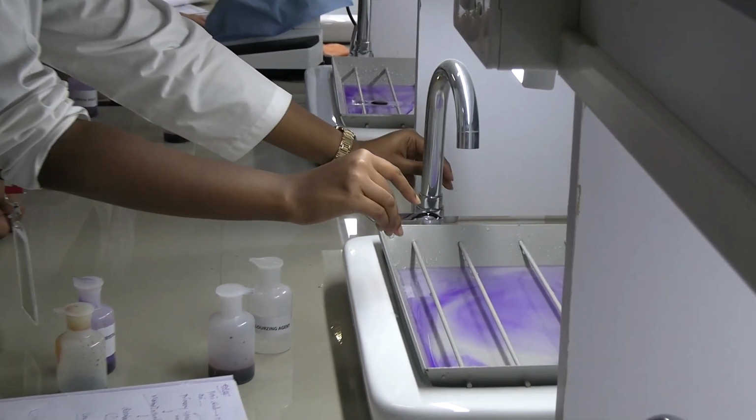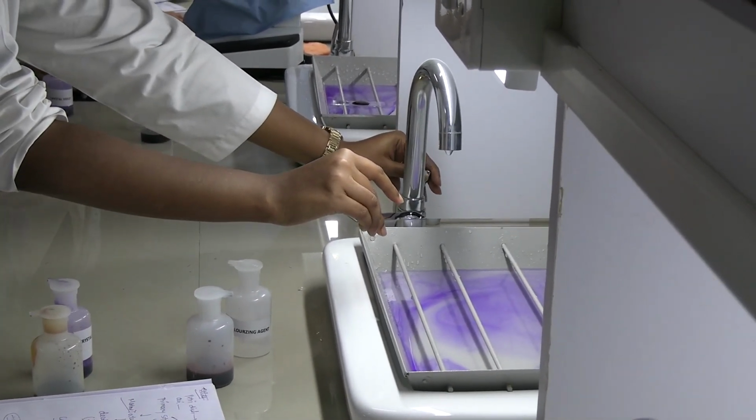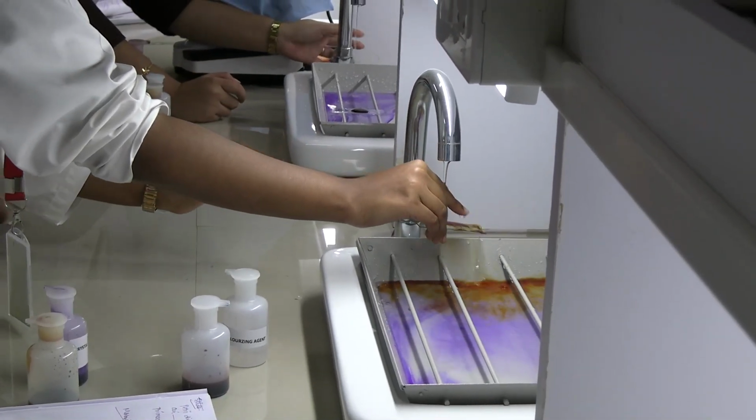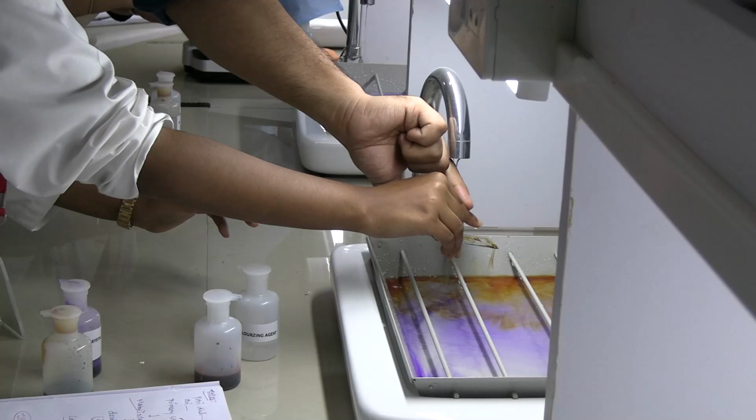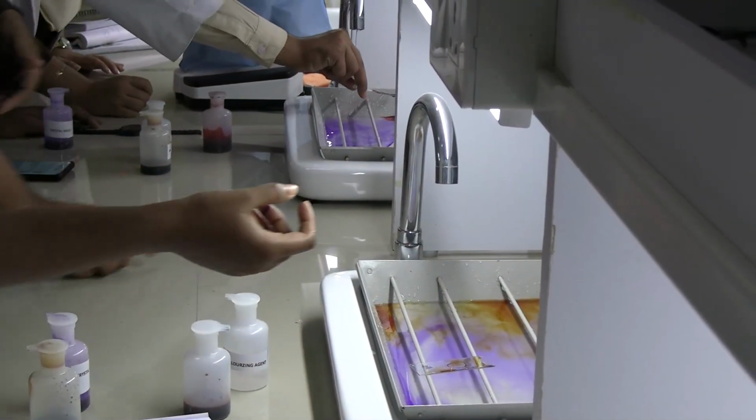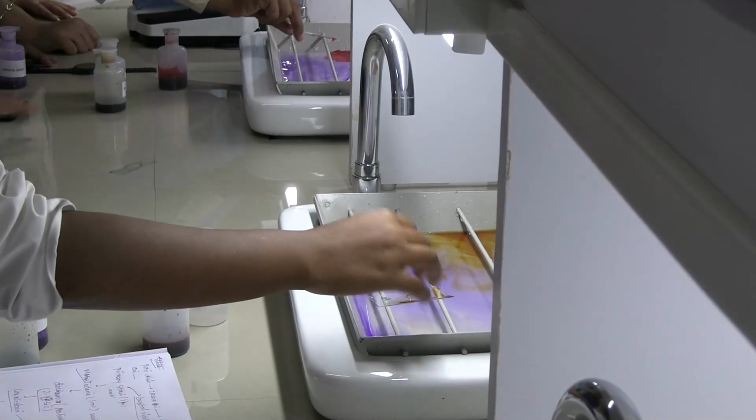Are you checking your time? Is it 1 minute? 1 minute gone. So wash it now. You have to wash. What is the second step? It's to wash now. You're not doing it right again. Okay, that's enough. Hold it at the end. So what is the third step? Remember. Wait.